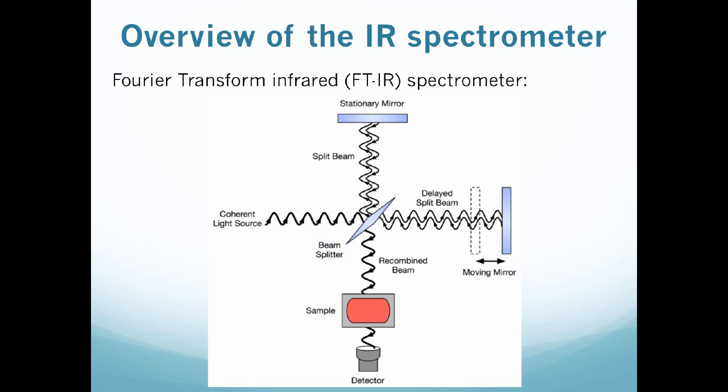If the IR radiation at a certain wavelength gets absorbed when it passes through a sample, then the intensity of the interferogram for that particular wavelength is going to decrease, which then changes the interferogram that exits the sample, and then that's detected by the detector. Now the computer gets that interferogram, and what happens is it's able to decode it to actually produce sort of a traditional IR spectrum. And that decoding actually makes use of the Fourier transform technique.